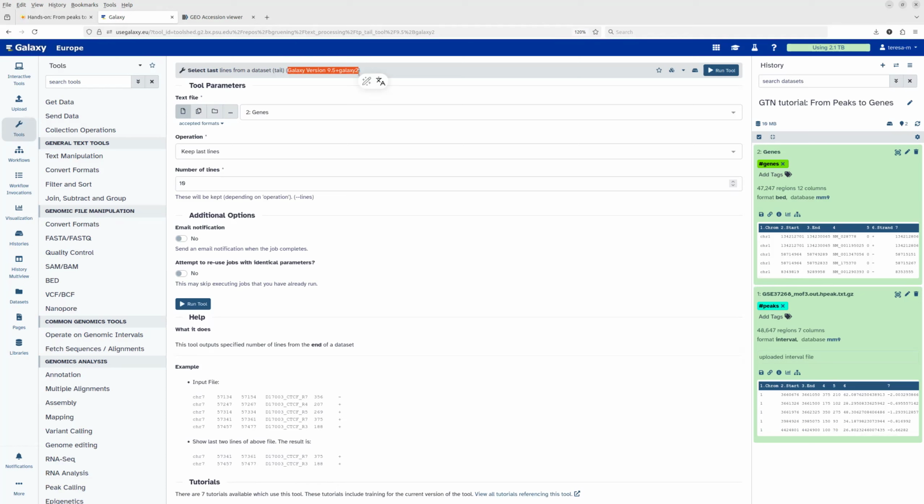If you want to compare and get exactly the same results as within the tutorial, you should use the same version that was used in the tutorial to make sure that you are not getting different outputs.